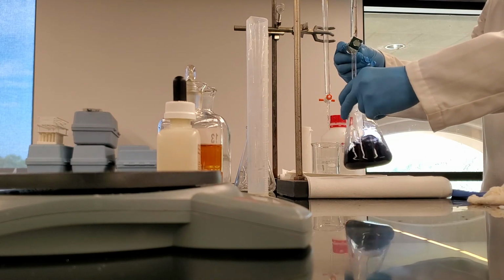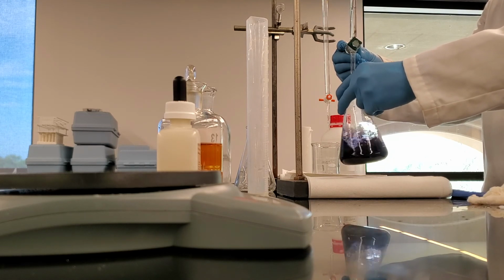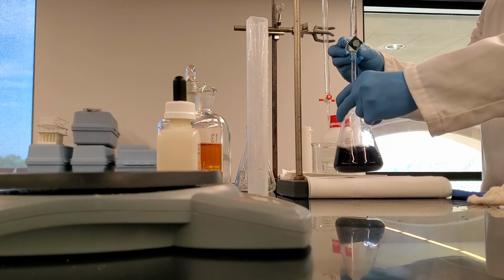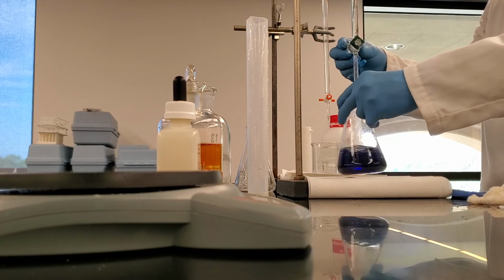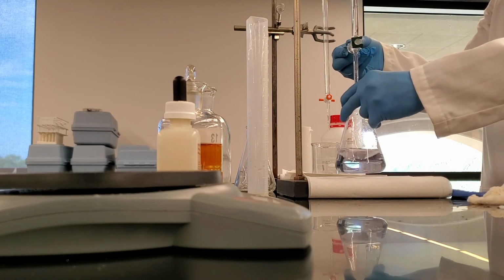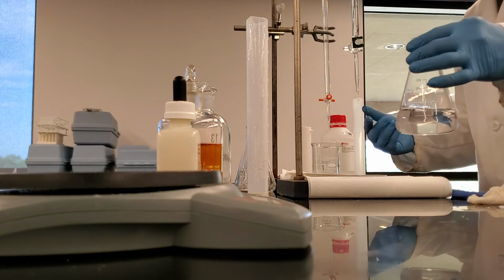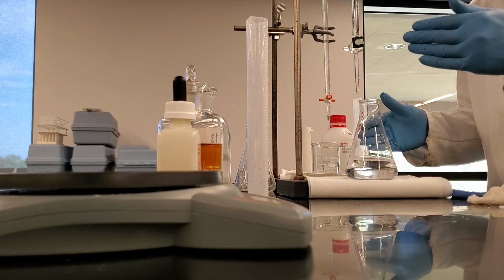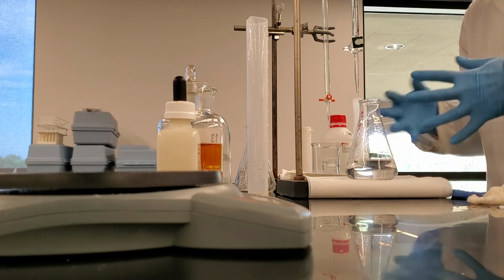Let's see. I'm adding a little slowly, that way I don't overshoot my endpoint. So the dark blue, okay. I think I probably overshot the endpoint by 1 or 2 drops. But anyway, the dark blue slowly changes to light blue, and then eventually it goes colorless.